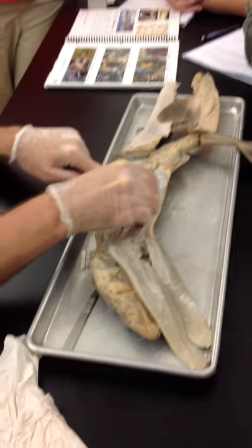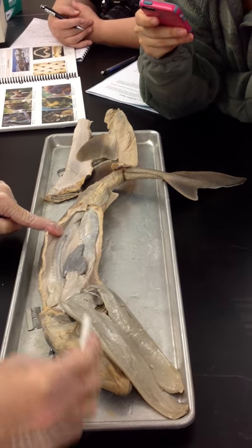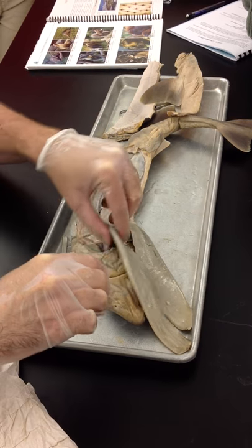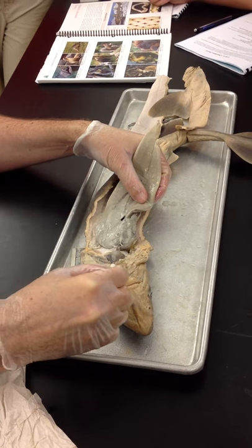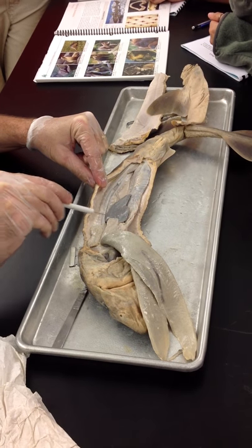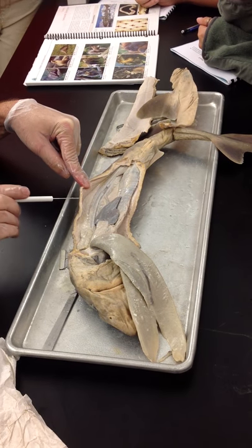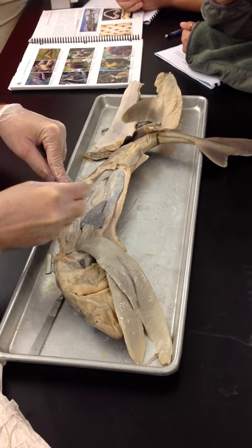Down here, this little gray pointed structure is the rectal gland. And that's about it — unless we cut into the brain, which we don't really need to. So this is the internal anatomy of a shark: heart up here, gills — four or five pairs on either side — lots of liver, testes, stomach up high, the J-turn, and this long structure here is the intestine. Spleen, kidneys, and sperm ducts pretty much packaged together right on either side of the backbone. And rectal gland.